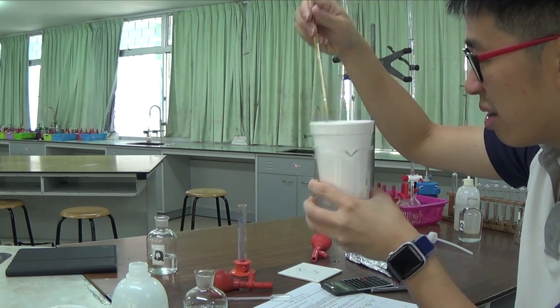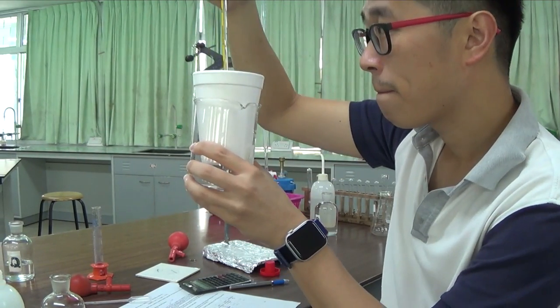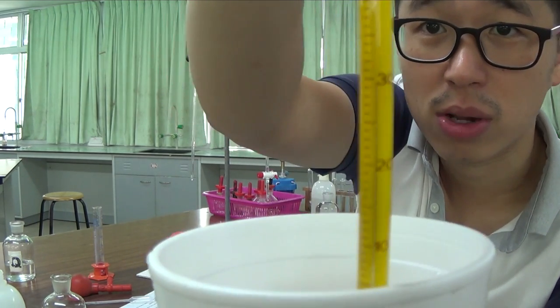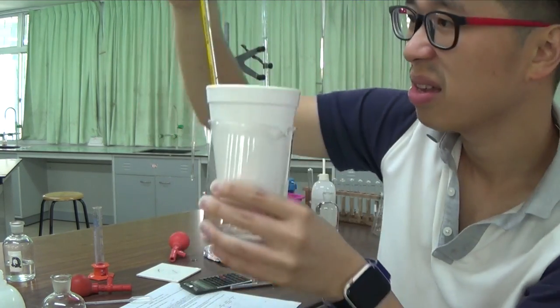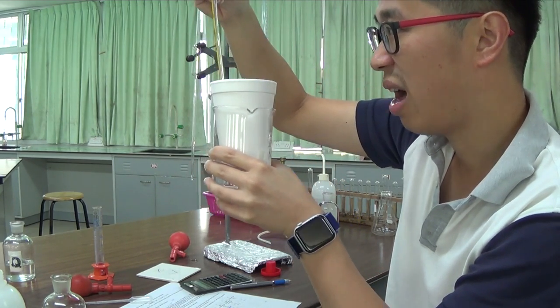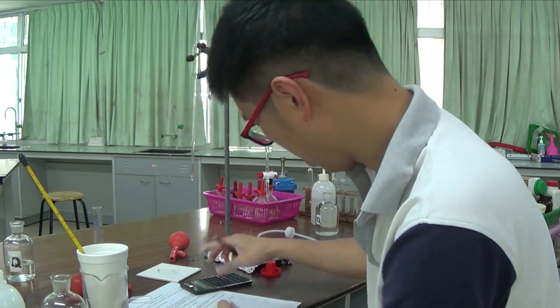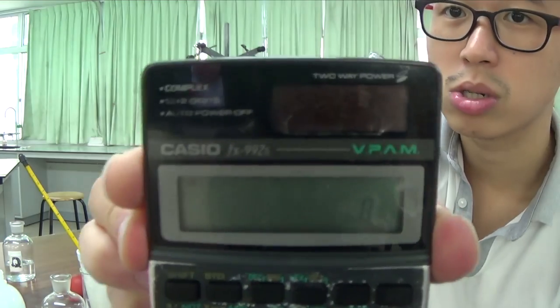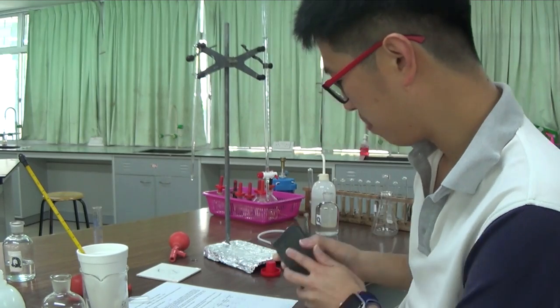It's close to 30 now. I wonder if it is going to increase beyond 30 degrees Celsius. So it is now around 30. I'm not holding this the right way, but the silvery mark there you can see inside is around 30. And it seems to be nice and happy settling there for 30 degrees Celsius. That's the highest temperature it reached, 30.0. So 30.0 minus 22.0. Again, this is what your calculator shows you. Not sure how clear it is. Okay, so it shows you it's just 8, but it's actually 8.0.